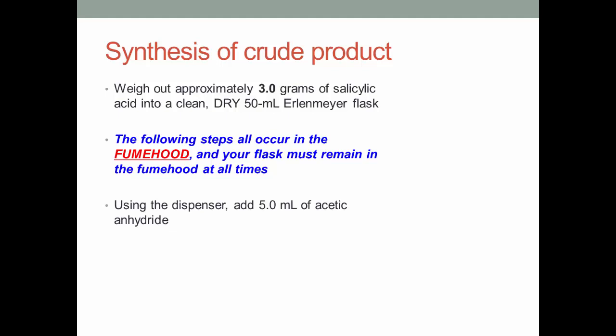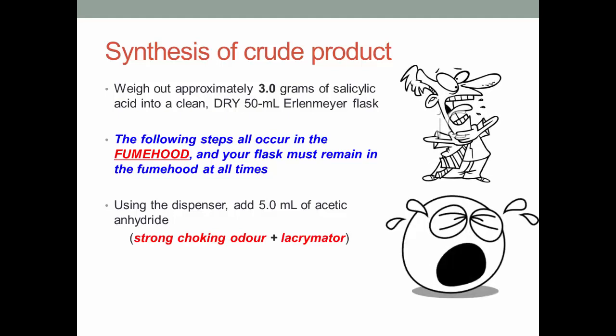Using the dispenser, add 5 ml of acetic anhydride. Acetic anhydride has a strong choking odor and is a lacrimator, which means it causes tearing. This is why these steps must occur in the fume hood. Then, wearing gloves, add 10 drops of 18 molar sulfuric acid and swirl the flask gently.